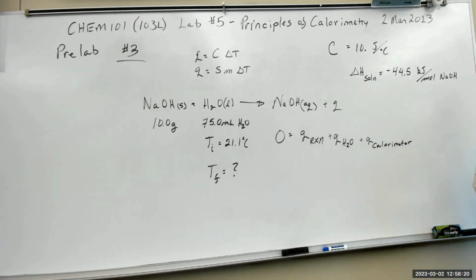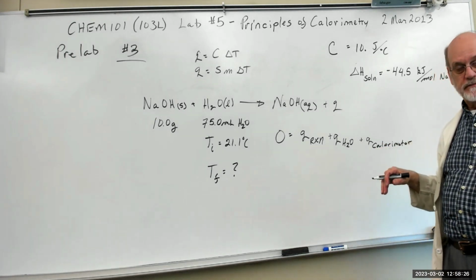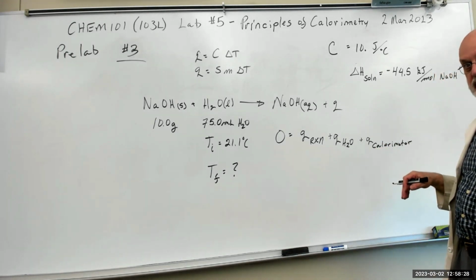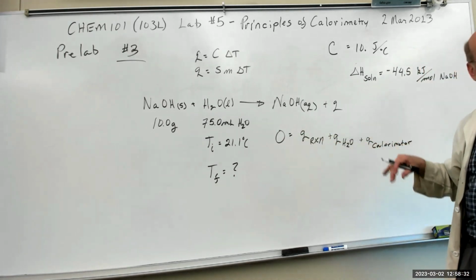That's typically what you'll be looking at, particularly with the procedures you're going to have in the lab. You'll have a reaction heat, a water heat, and a calorimeter heat.